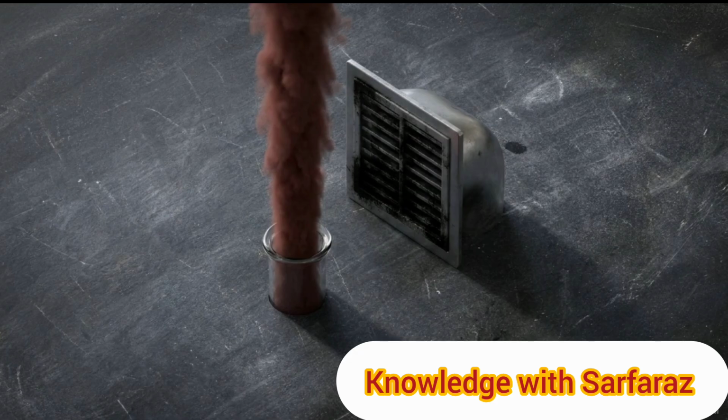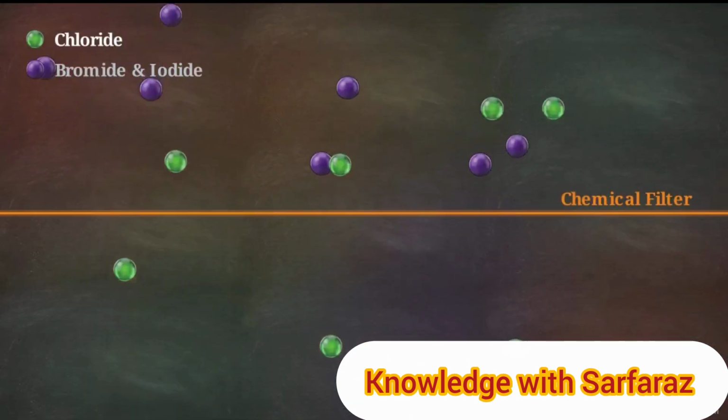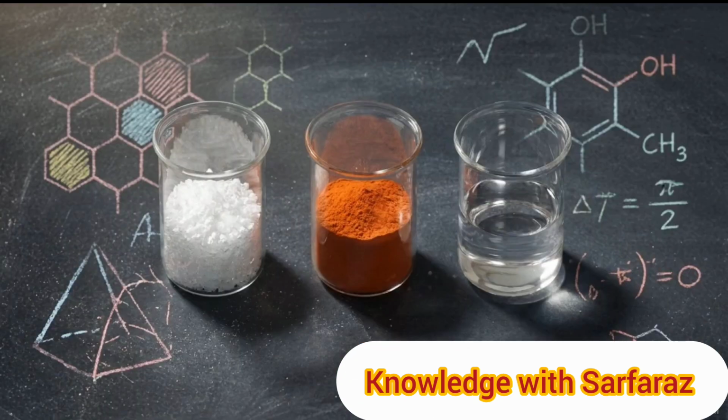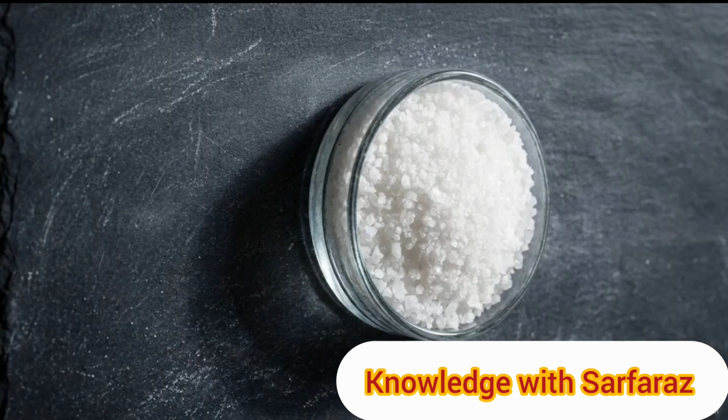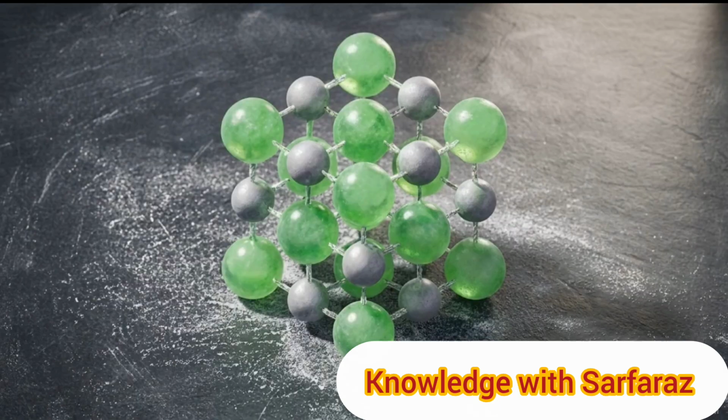Understanding how this test works requires looking past the red smoke. What we are really building in that test tube is a calibrated chemical filter, designed to separate one specific halogen from all the rest. The protocol requires exactly 3 starting materials: the unknown salt, solid potassium dichromate, and concentrated sulfuric acid. For the reaction to initiate, the unknown salt must be an ionic chloride, like sodium chloride or potassium chloride.